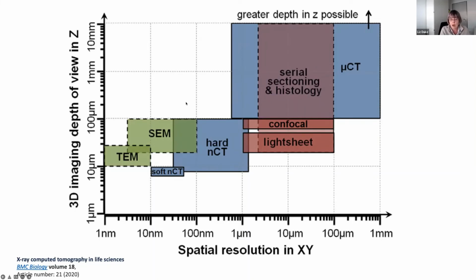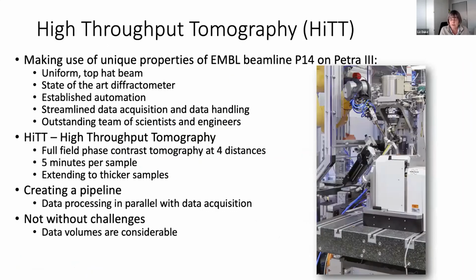And so I'm looking at exploiting the X-rays to image what I would call bulk samples of tissues. That tends to be the sort of biopsy, 1 millimeter biopsy punches and similar things. But we can also image small organisms and organoids as well.